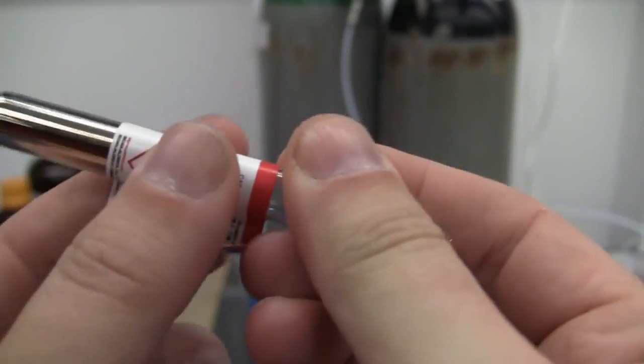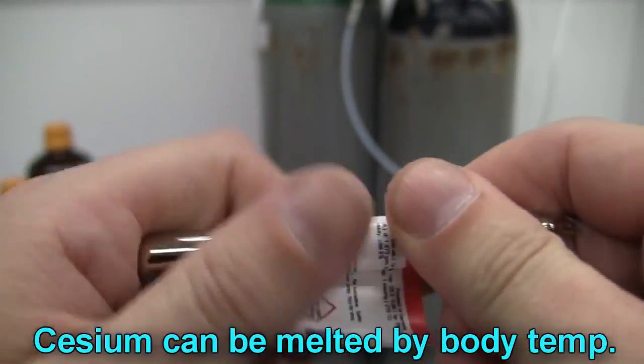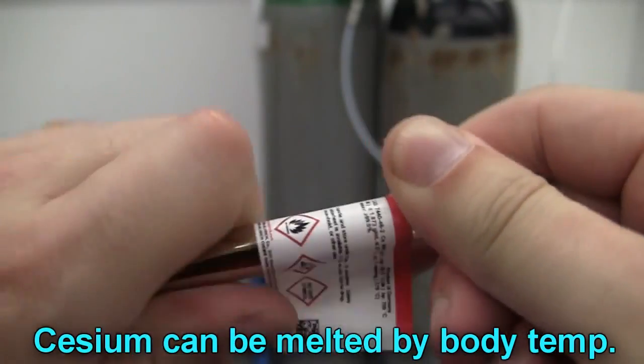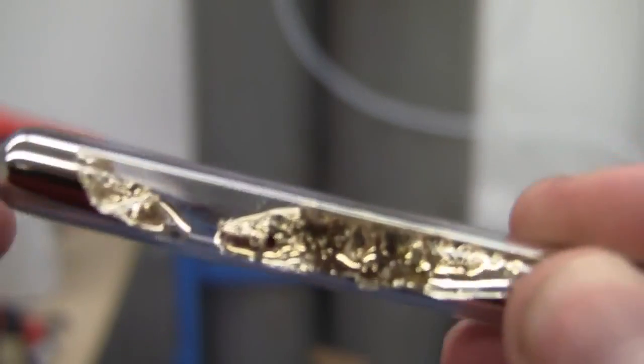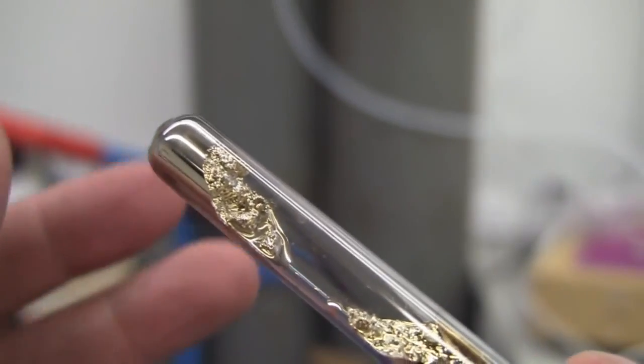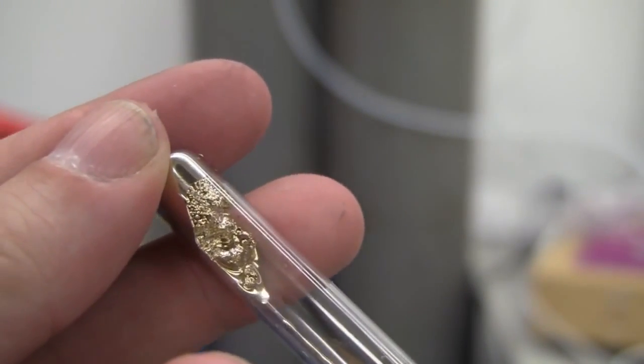So, now we have cesium. As you can see at the moment, it's really quite solid. I'm just going to warm it up with my fingers. Here, I've got it partially melted. I'm just going to melt the rest of that. That's melting anyway. Just like that.